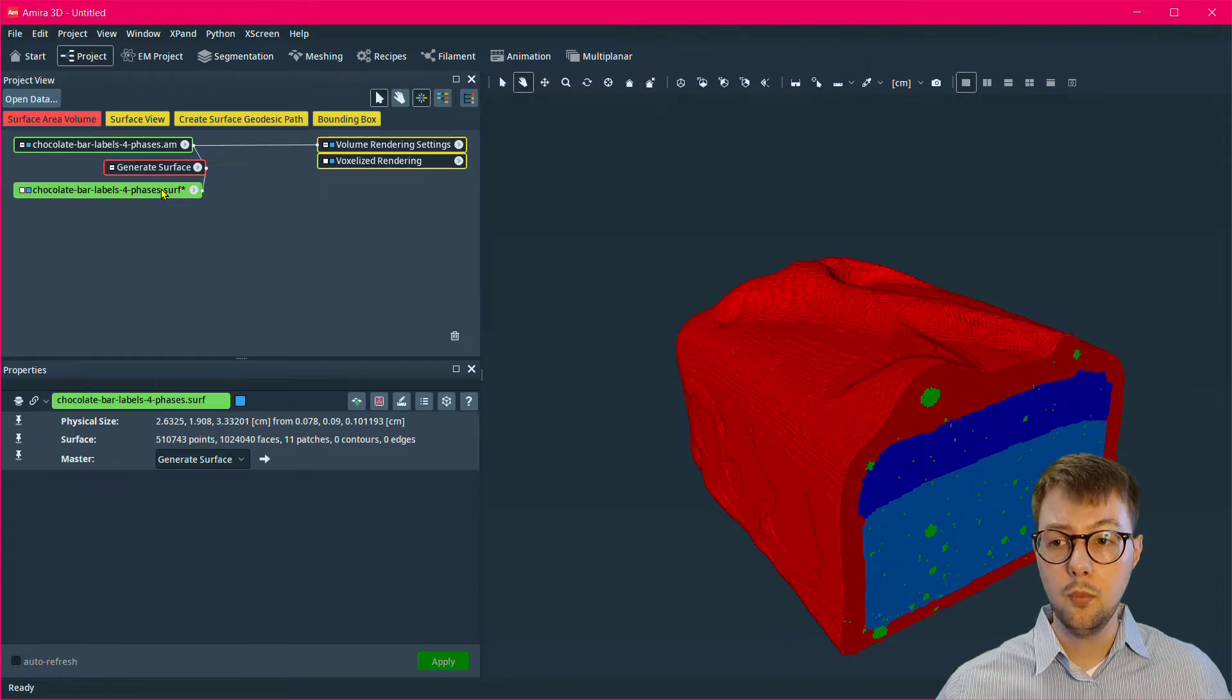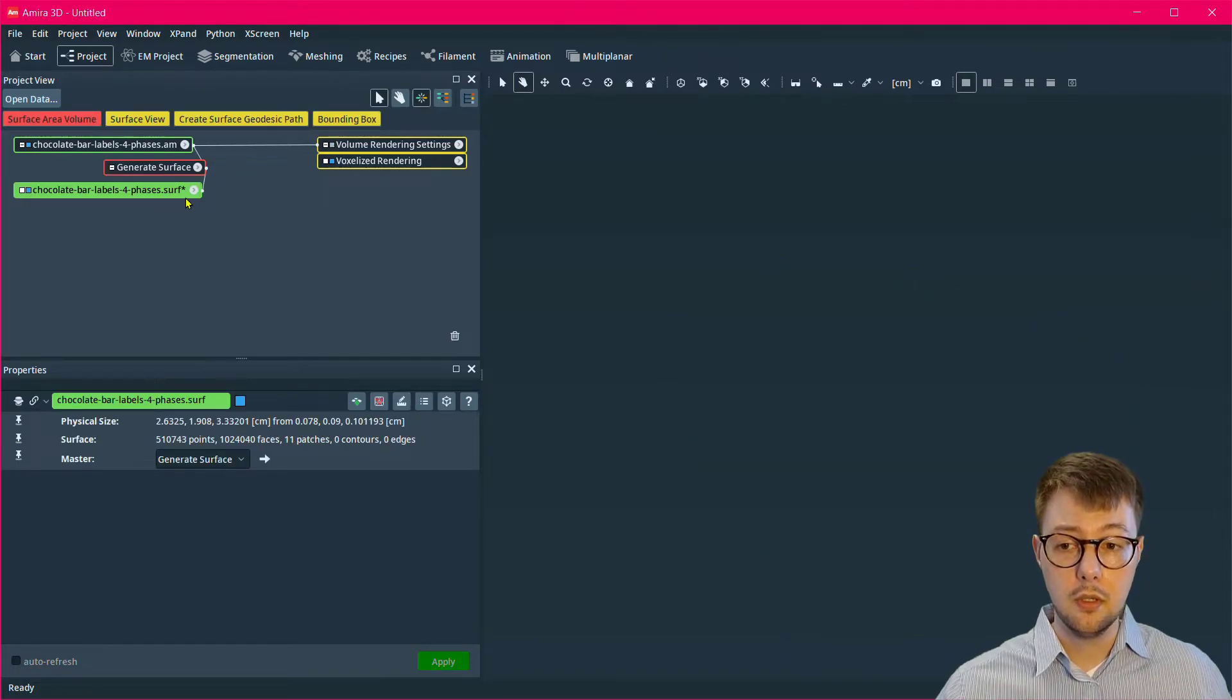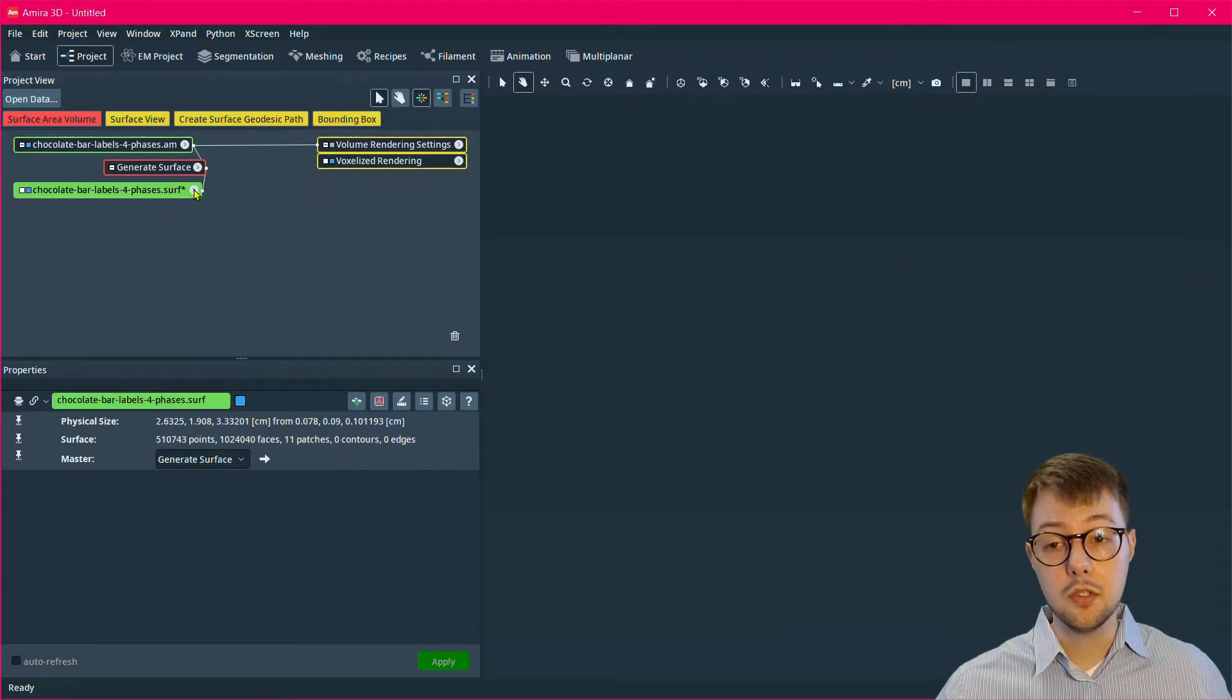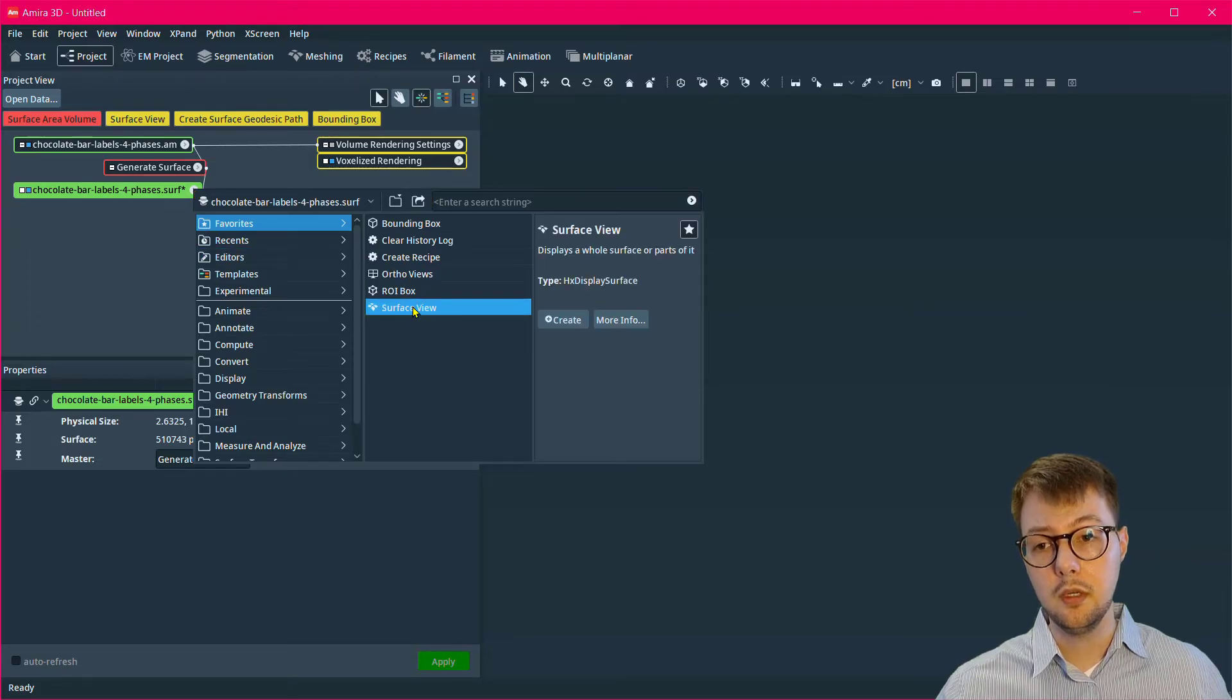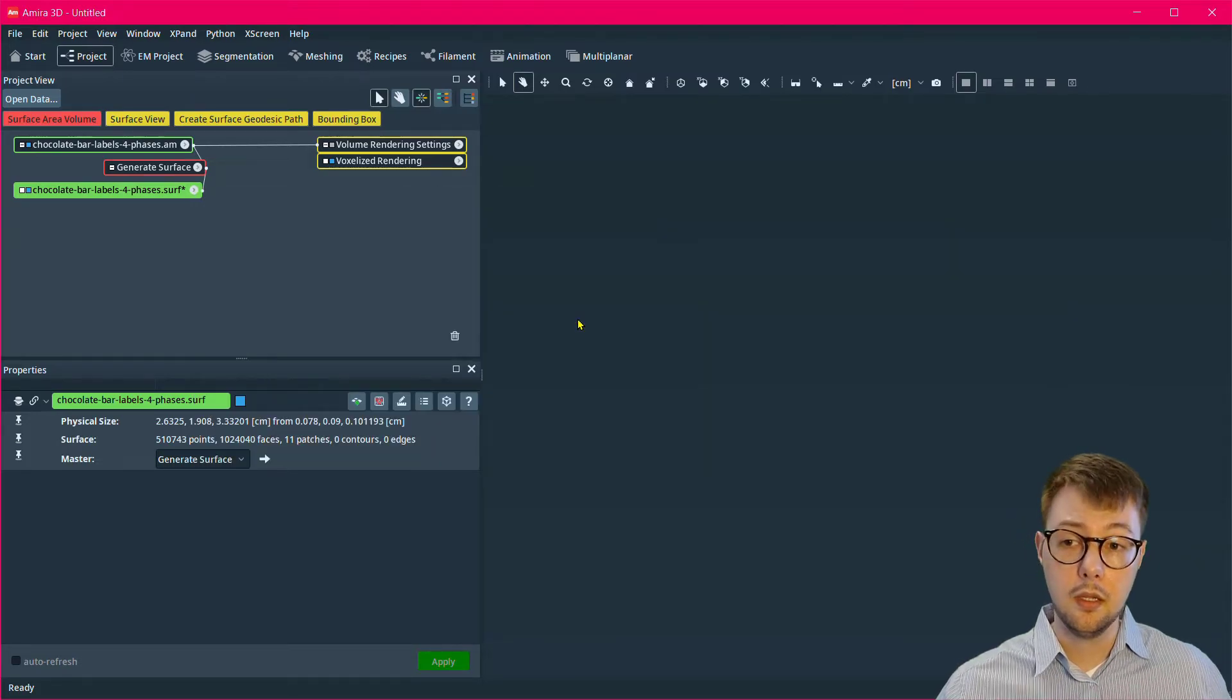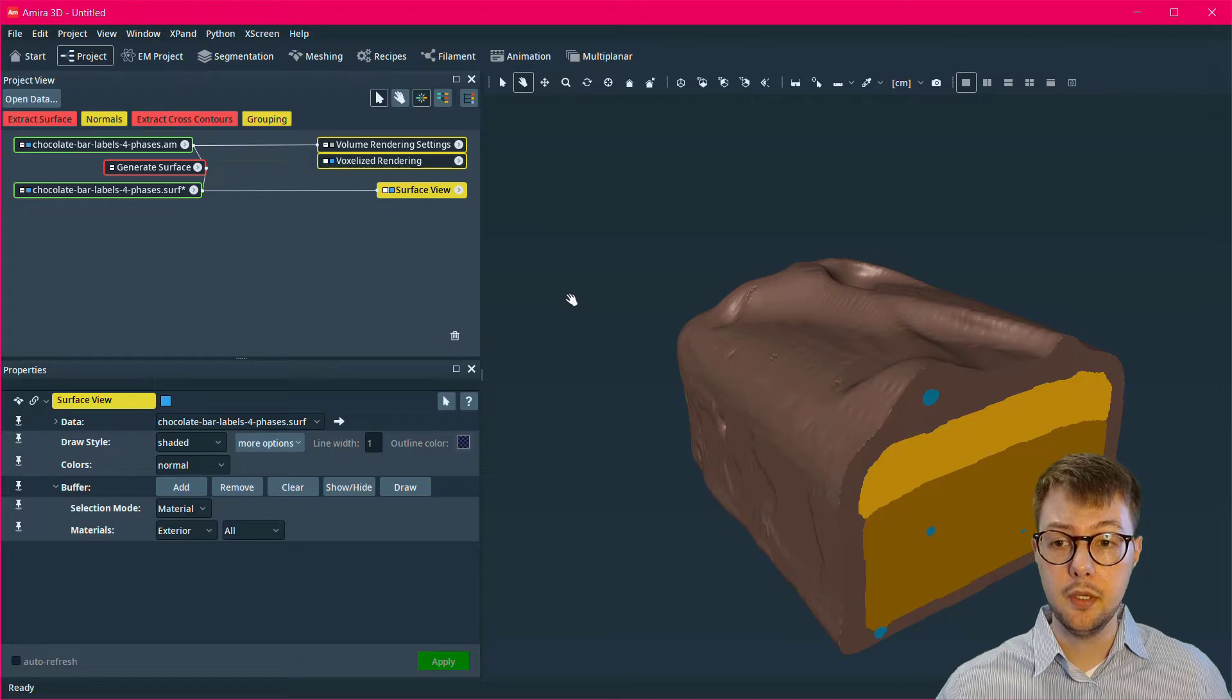And with the output, which is a surface, I will attach a surface view to those data after hiding the volume rendering from the label data itself.